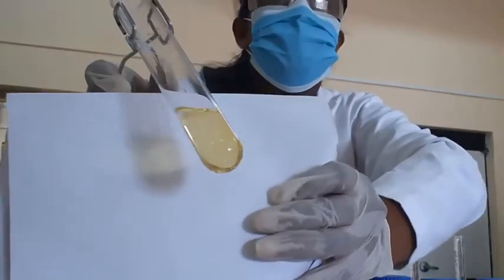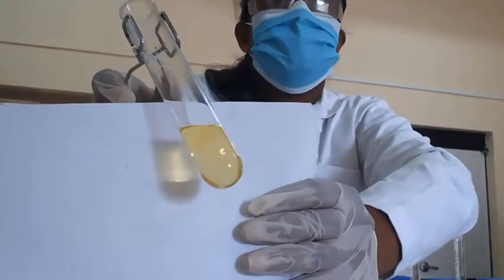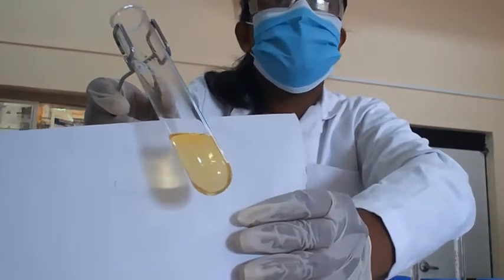See, in here also the colorless solution has become yellowish in color.